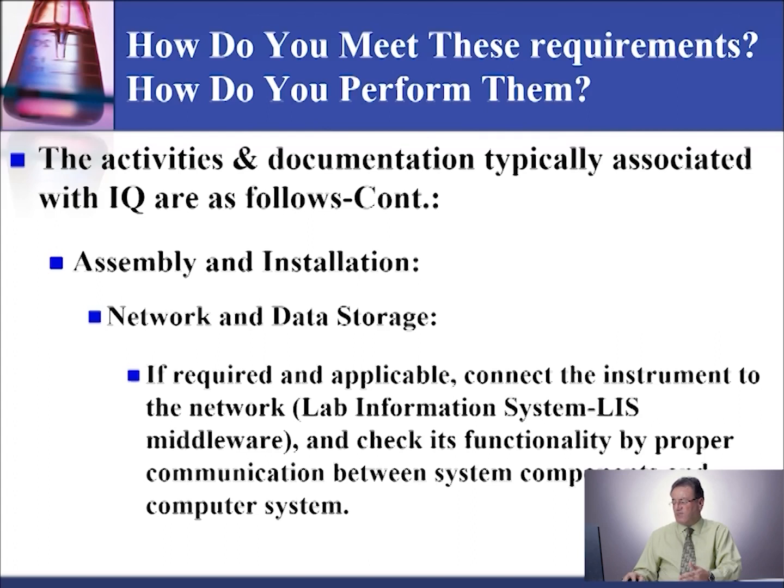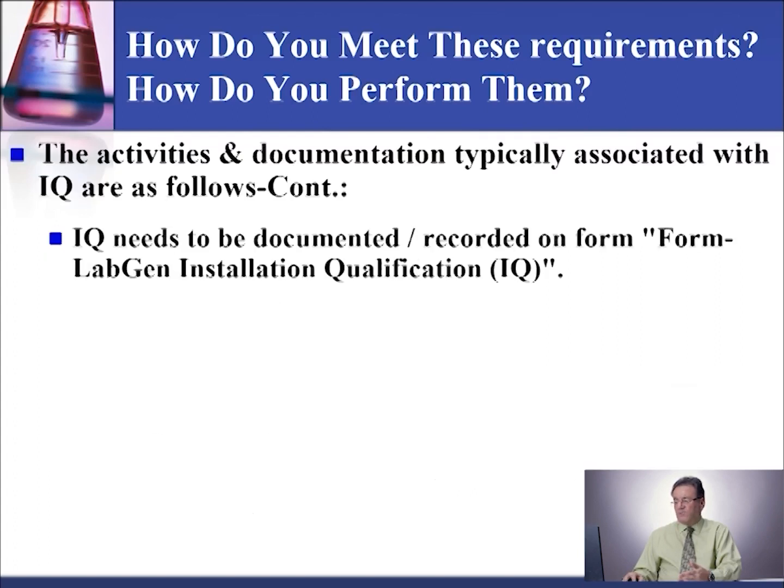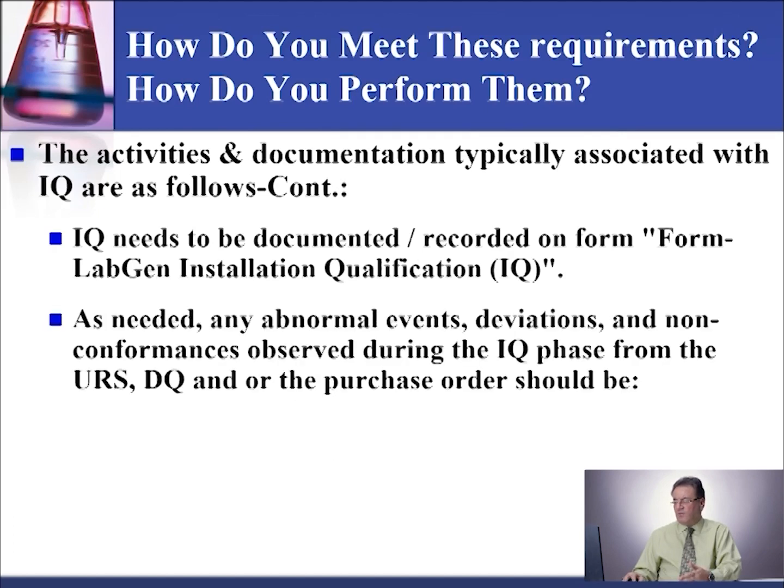Subject summary: the qualification of laboratory equipment and instruments is a critical step to ensure the reliability of the analytical data generated by them, to ensure a safe and smooth qualification process, and to align with the manufacturer's claim and or user requirement or specification.